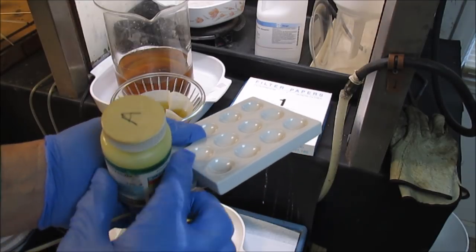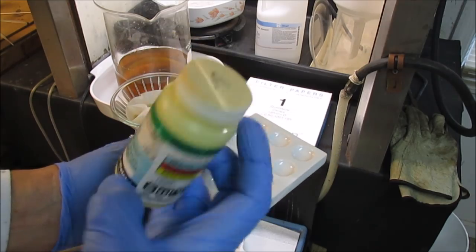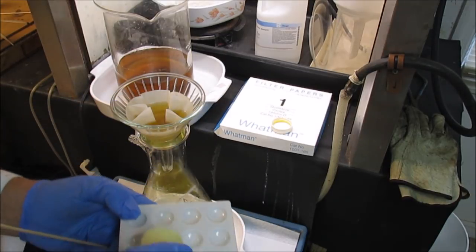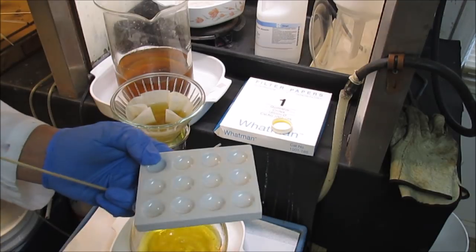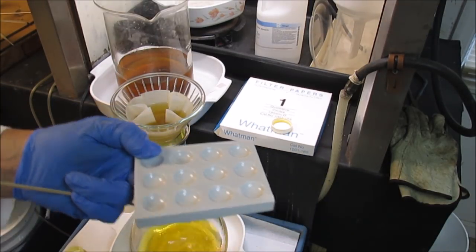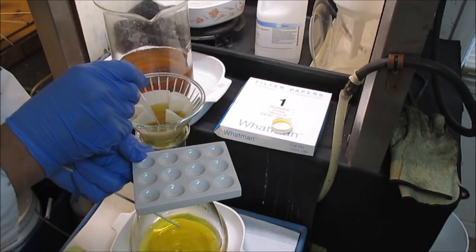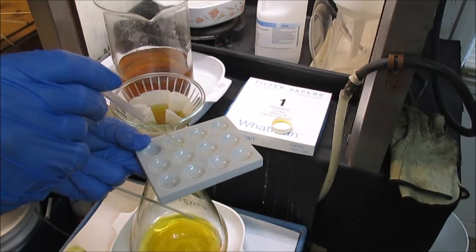I've got a spot plate here, some ammonium thiocyanate. I'm going to put a little bit of this in the spot plate, just a crystal of it or so. Now I'm going to draw out some of this liquid. If it turns bright red or blood red looking, then that means that this solution's got iron in it. That's what I suspect is here. If this turns red, this means iron.